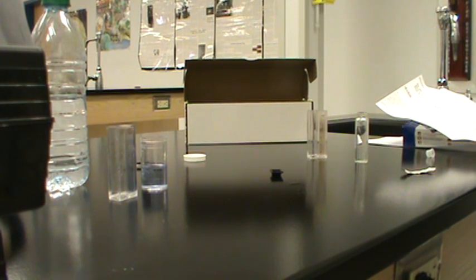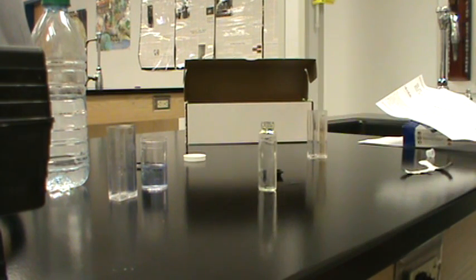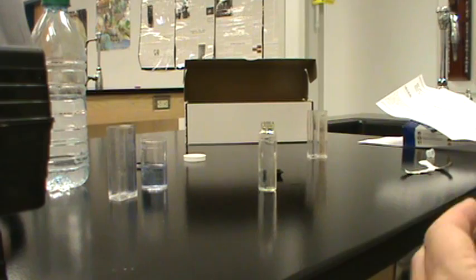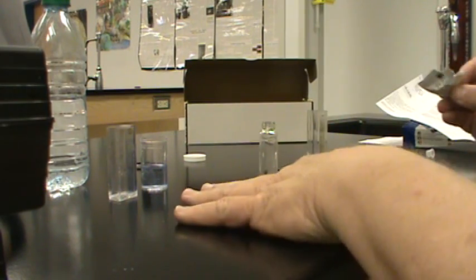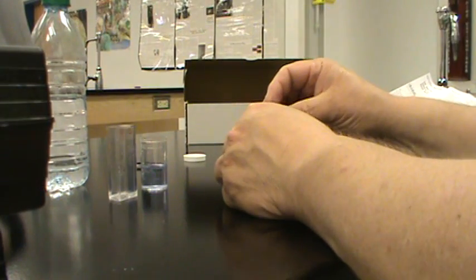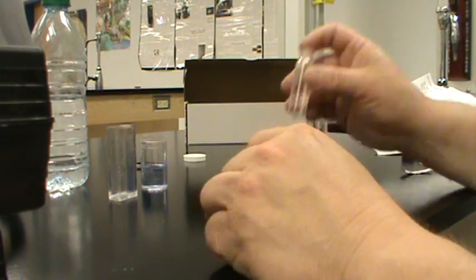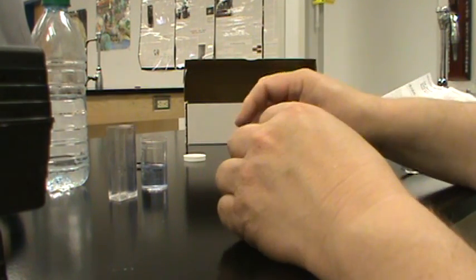Right now I'm going to open up the pillow. Now this one is a little bit trickier. This one has a little vial for us, and the thing the kids had the biggest problem with in the lab yesterday was trying to get the powder into this teeny tiny little vial. So we take our pillow and we're going to get that down really small and pour that powder right in, most of it in there. We're going to cap it just like that, and then we're going to shake it up and down. And now we're going to unstopper it, set it aside, and let it sit for about the three or four minutes it's going to take us to talk about the phosphate experiment. That's why we picked these two to do together.